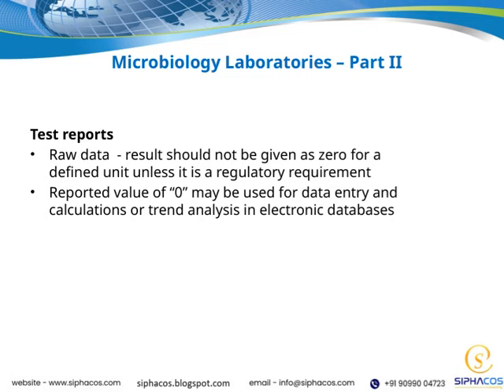Let's talk about test reports. When it comes to raw data, the key point to remember is that the result should not be recorded as 0 for a defined unit unless there's a specific regulatory requirement to do so. This is important because reporting a 0 when it's not required can lead to inaccuracies in data interpretation.